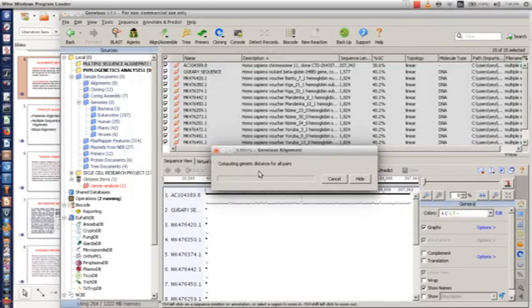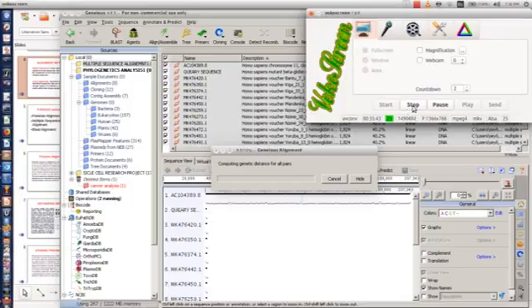So it's going, the Geneious alignment, still going. Wow, 0.014. I think it's going to take a little bit more time. So give me some time, we're going to be back in a short while.